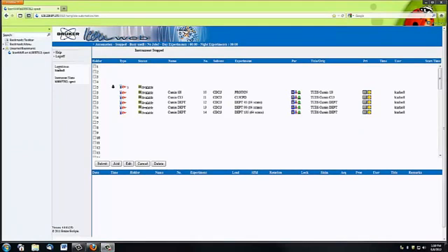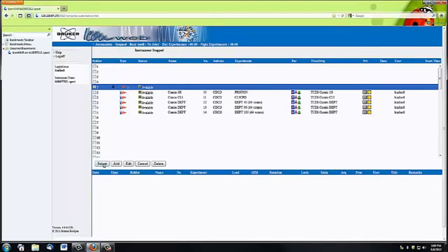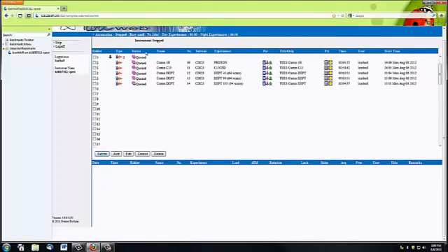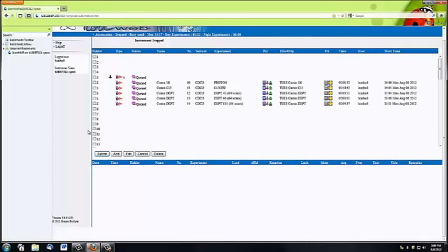The last thing you'll need to do is make sure you actually submit the experiments. Right now, you can see that under the status, they still say that they're available, which means that your experiments won't actually run. So you again need to click on your holder number and select submit, and you'll see that all of these will change to queued instead of available. That's when you know that your experiments will be run, and when they're finished, you'll receive an email from Felix that will have your FIDs.